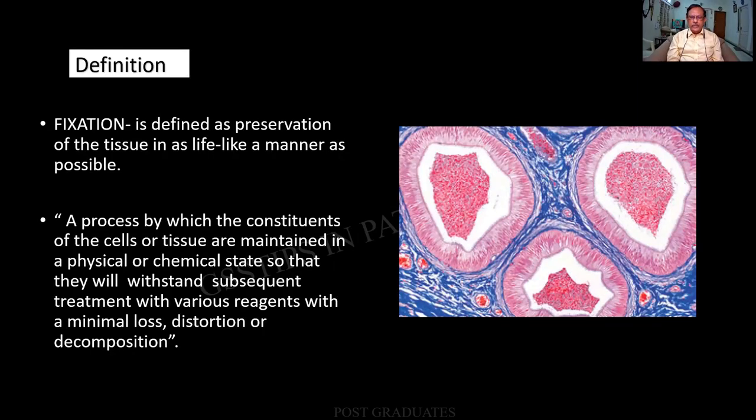Definitions are definitions. No own words, please. When we were students, the first thing we were asked to give was a definition. It is defined as the preservation of a tissue in as lifelike a manner as possible.